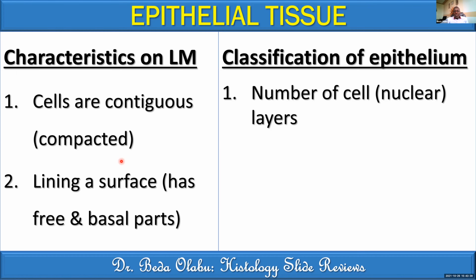If you have only one nuclear zone, or appear like almost one, then call it simple epithelium. If it's multiple nuclear zones and it appears like the nuclear zones are occupying all the zones of the epithelium, then call it stratified epithelium. If you see multiple nuclear layers or multiple nuclear levels, and that the apical zone is devoid of these nuclear levels, call it pseudostratified.